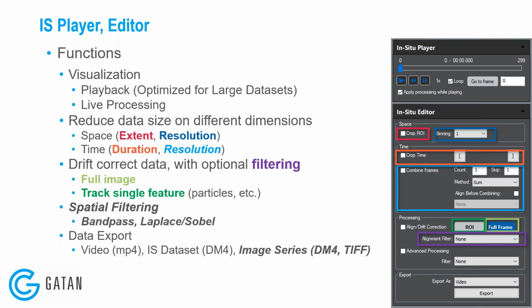Then we also have a new capability in the IS player now to do spatial filtering. Again, I'll show this in the live demonstration, but we can do bandpass filtering, we can do edge detection filters like Laplace or Sobel filters, and several others as well.